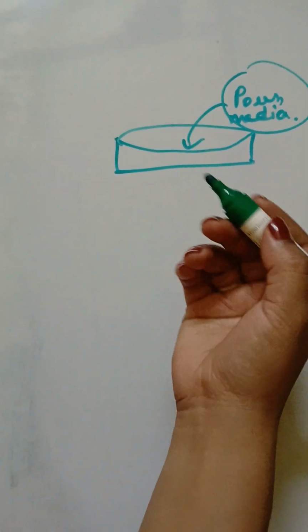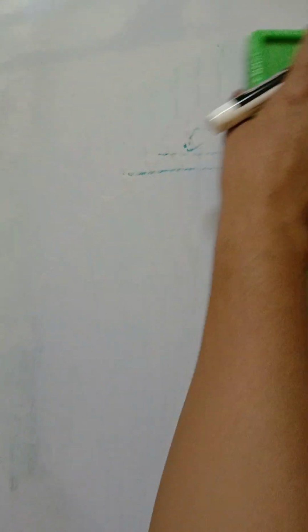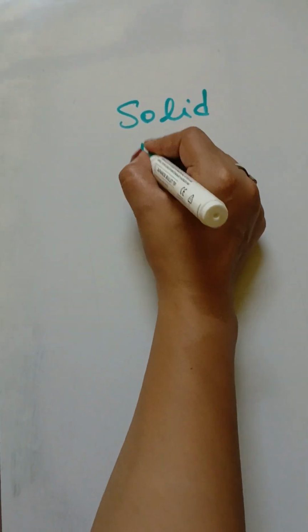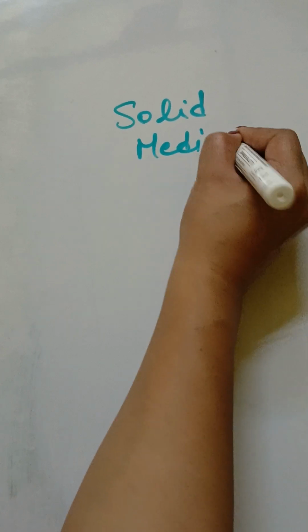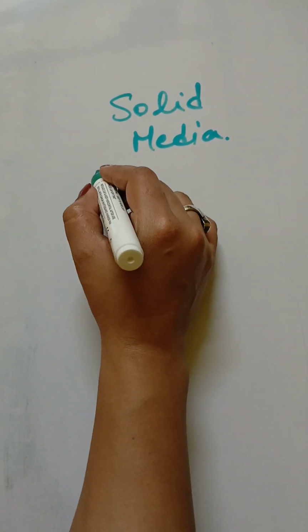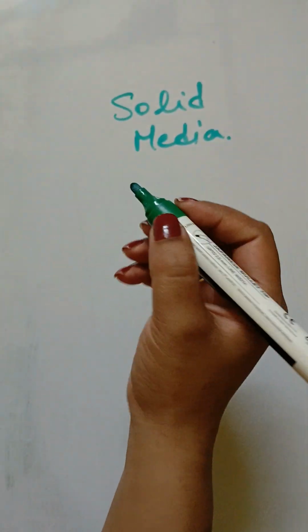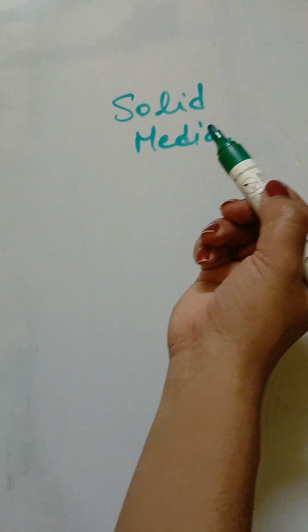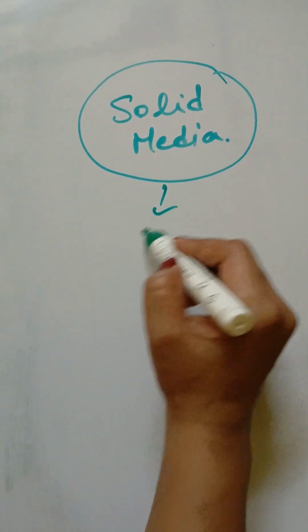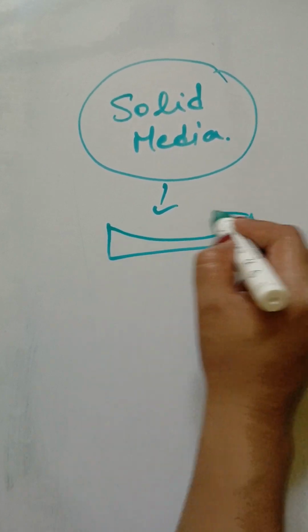To culture the bacteria, to get pure, well isolated colonies of bacteria, we need a solid medium to grow the bacteria. A solid medium means there is some important thing, a hardening agent, present in the liquid media. We have to add it to the liquid media to make it a solid version, so that we can pour it in a glass Petri plate.